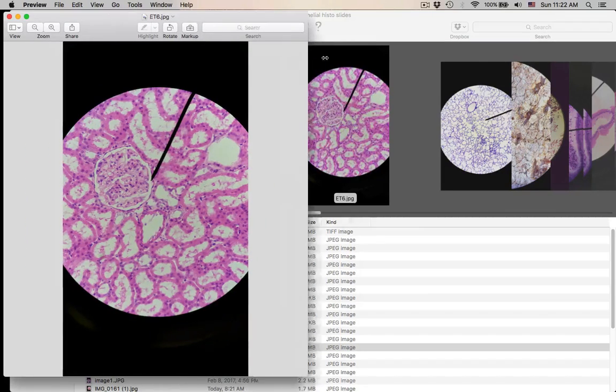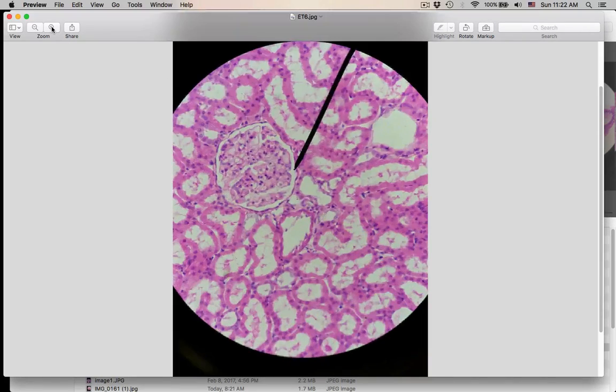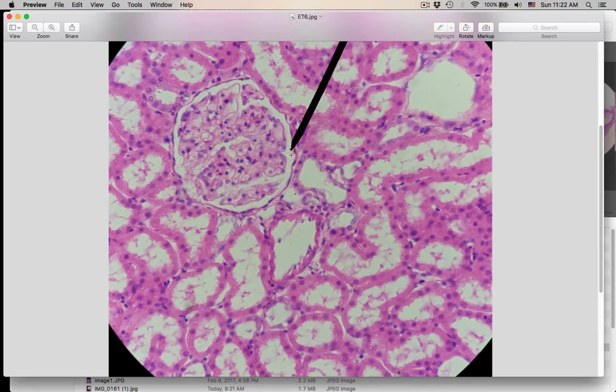Now, this is basically the same, it's from the same organ as the last one, and the pointer is in the same place, but for this one, number 14, I want you to tell me what organ this is from. Nothing else looks like this that has these globs here with this epithelial tissue. What organ is this slide from?